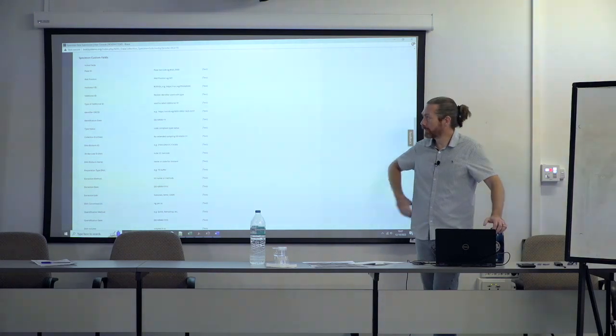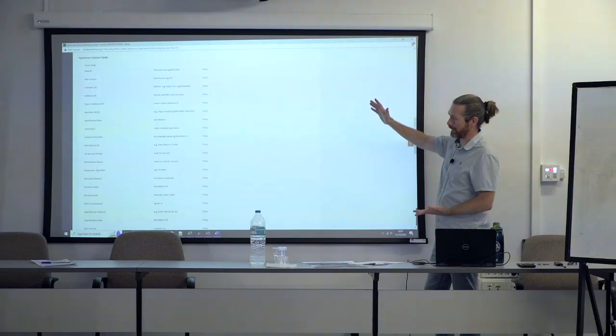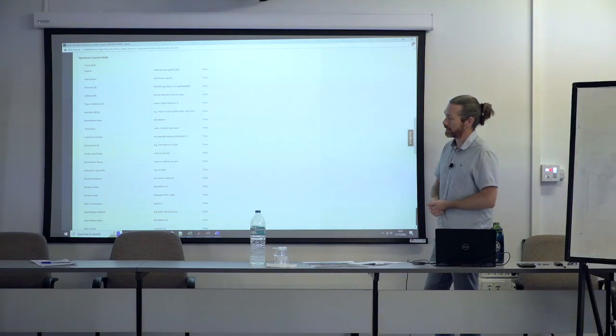But this is just to highlight that it's super flexible. You can add as many or as few custom fields as you want.